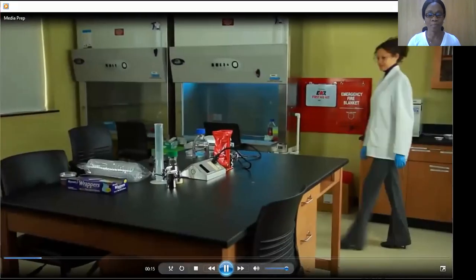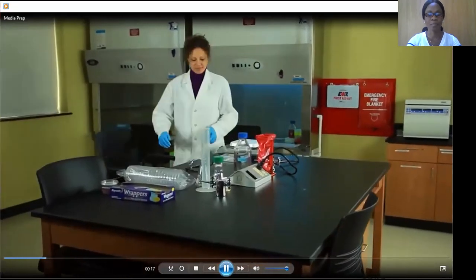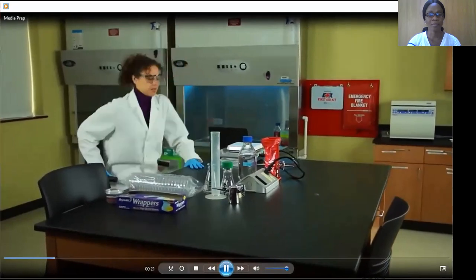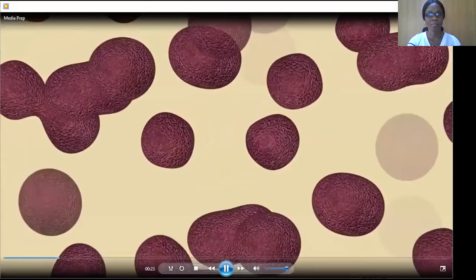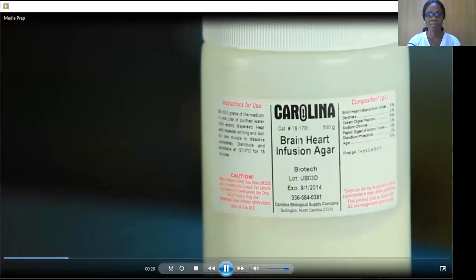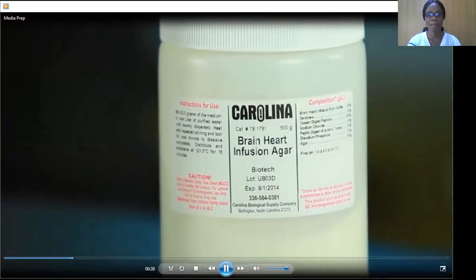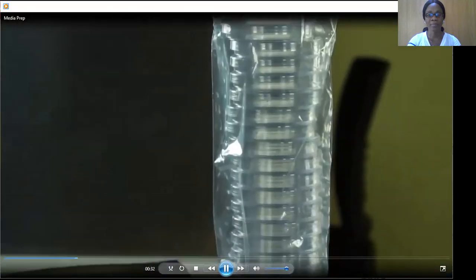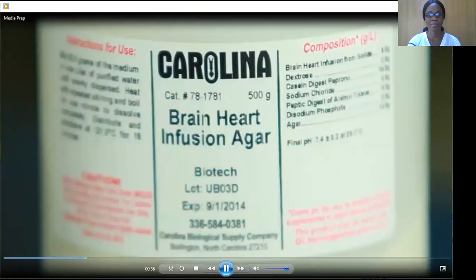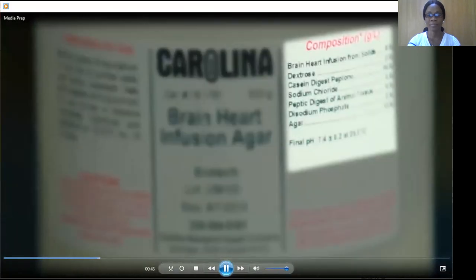In order to grow, cells need very specific environmental conditions: food, energy, proper temperature, and humidity. When growing cells in the lab, we have to create these conditions using culture media. Solid culture media is a mixture of agar and nutrients poured into petri dishes. In this exercise, we'll demonstrate the steps for preparing brain heart infusion agar. Always check the lot number and expiration date. The right panel lists the composition of the media and the final pH.